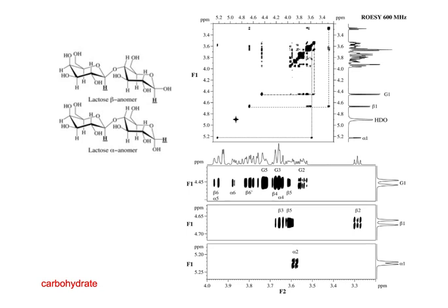And so in this case, we have the different protons. Let's see, for alpha 1 here, it essentially doesn't show anything, except this is alpha 1 to alpha 2.